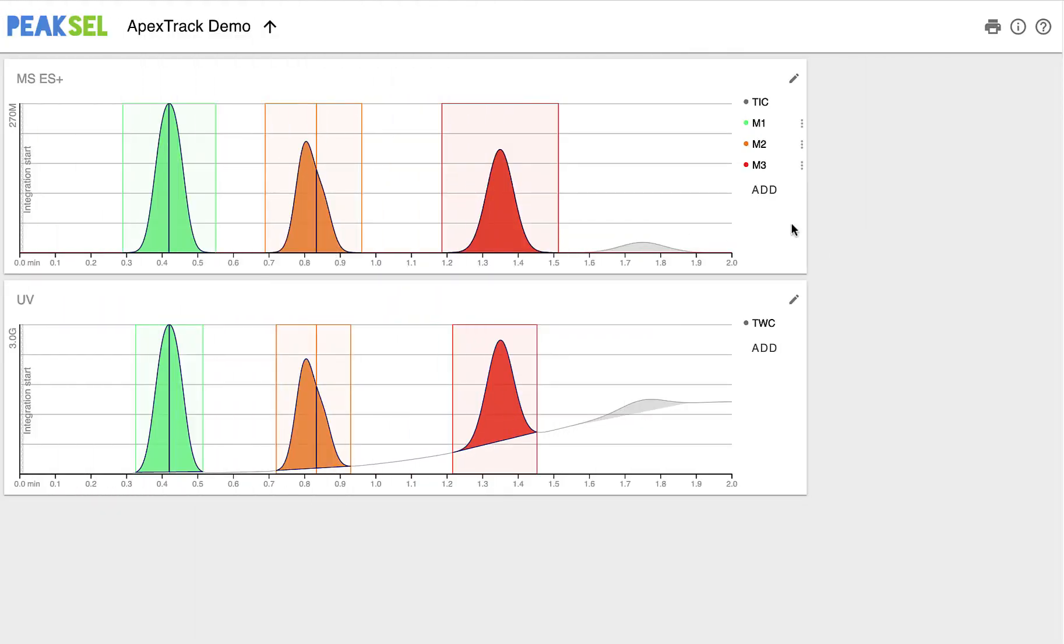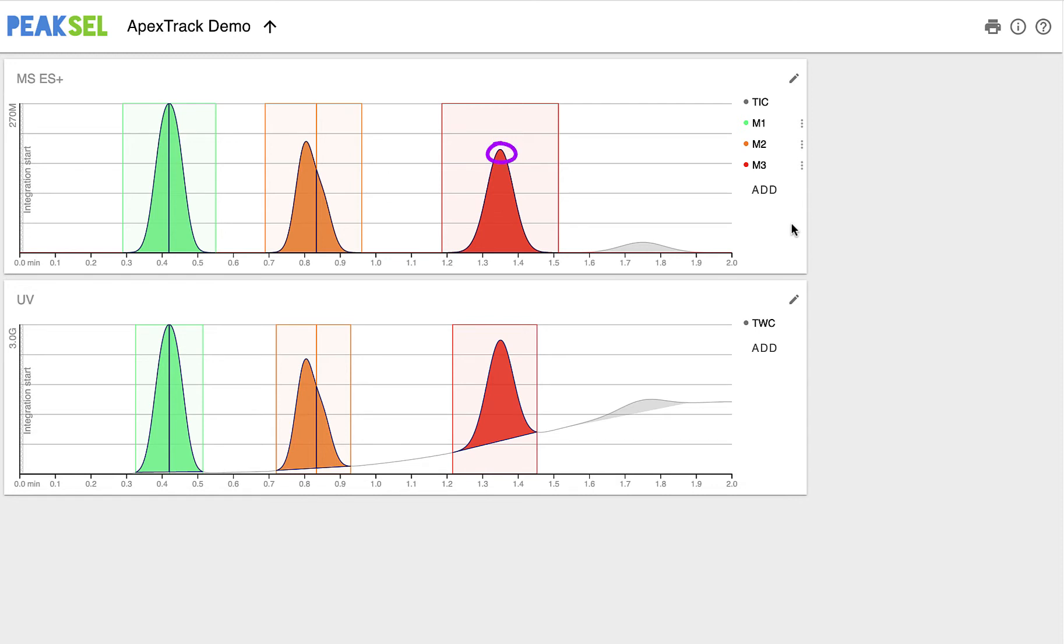Some algorithms start by detecting sudden changes in the upward slope of the signal, then they detect changes in the downward slope. ApexTrack, on the other hand, starts by detecting peak apices and then descends from both sides to find peak boundaries.